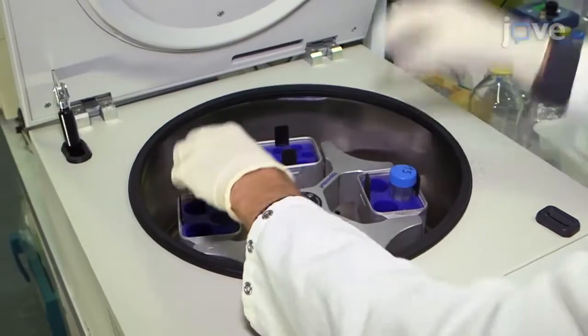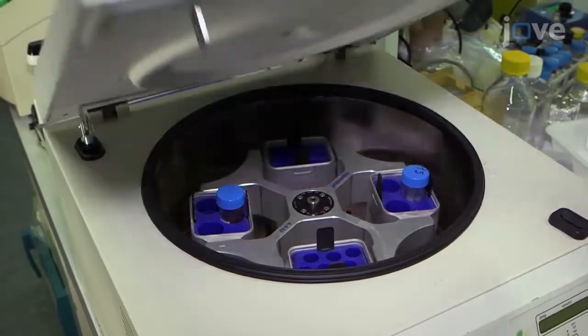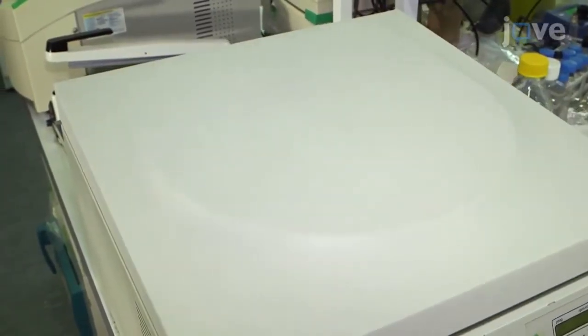Then, centrifuge the tubes of collected blood at 650 g for 20 minutes to separate the cells from the plasma fraction.